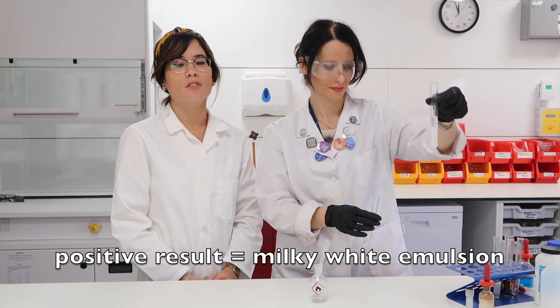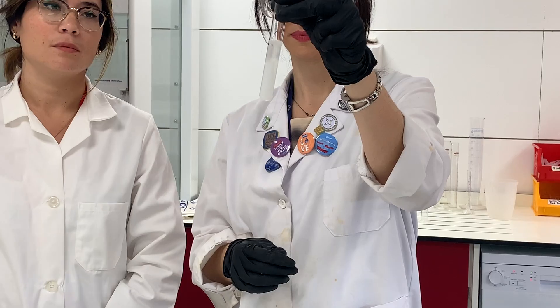So to summarise, to test for fats, you add the fat to some ethanol, and then you pour the mixture onto a test tube containing water, shake, and a milky white emulsion should form. But really all you have to say is: add ethanol and water, shake, milky white emulsion formed — three marks.